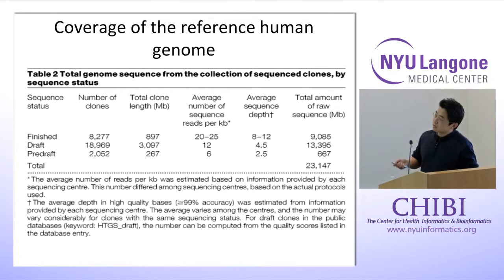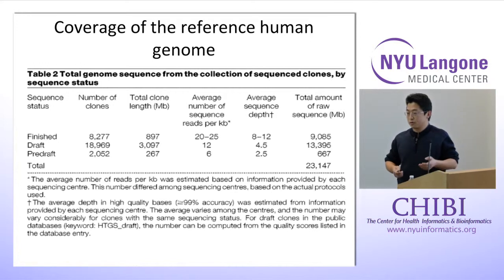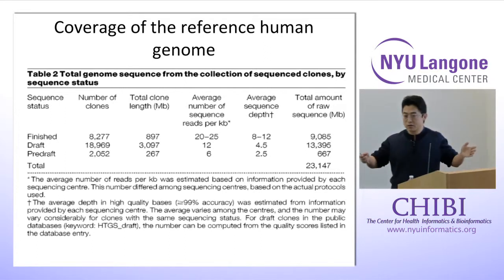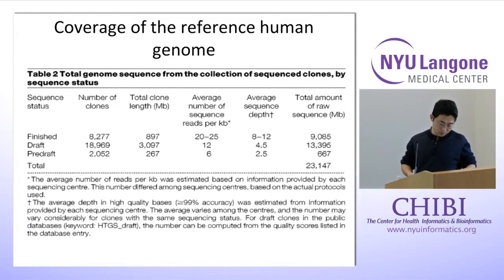determine the depth requirements depend on the sequencing technology and the error rate of the platform. Early on they used Sanger sequencing, so the error rate is relatively low compared to short read sequencing, and the read length is longer. So when you assemble the genome, you don't need that high depth.